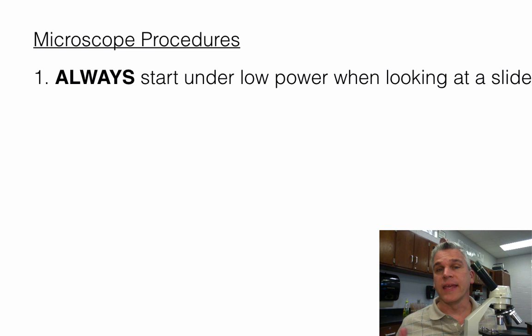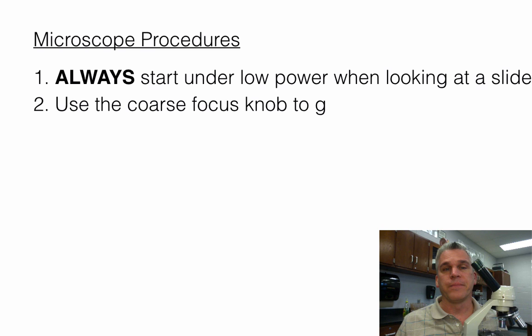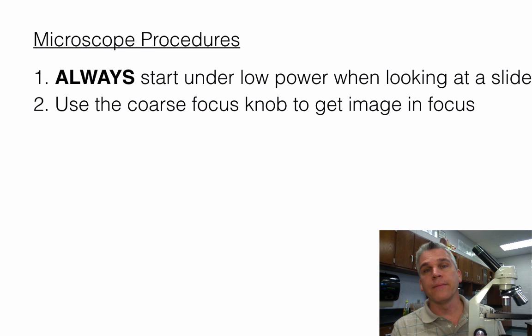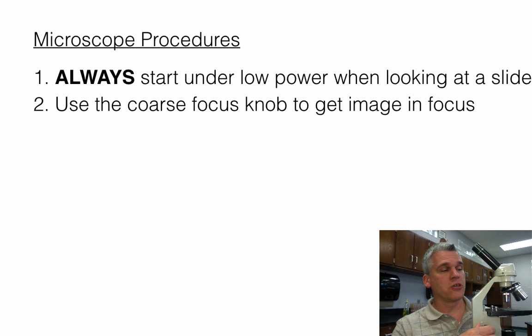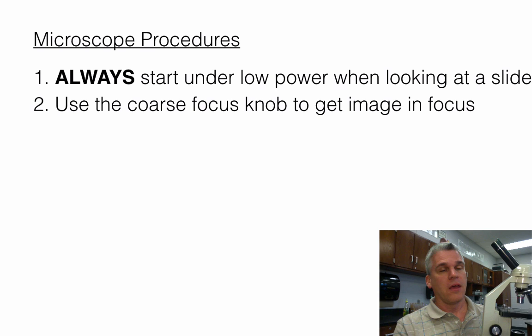Use the coarse focus knob to get the image in focus. We have two knobs: the larger one is the coarse focus — watch the stage go up and down as I turn it. The smaller knob is the fine focus; when I turn it back and forth the stage moves up and down slightly. This helps us to really get things in good focus.